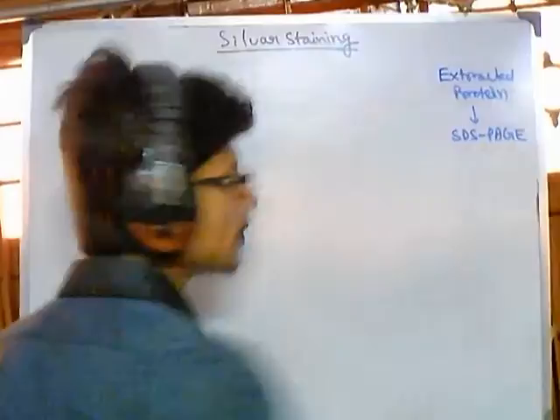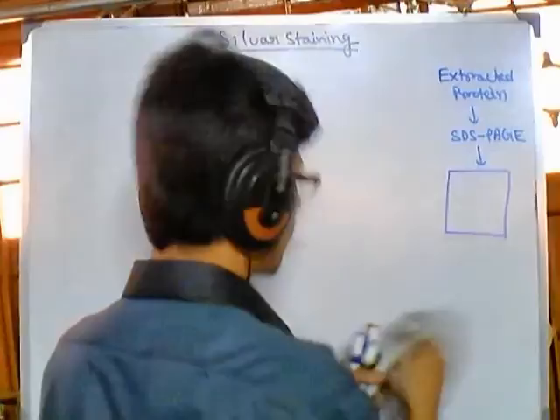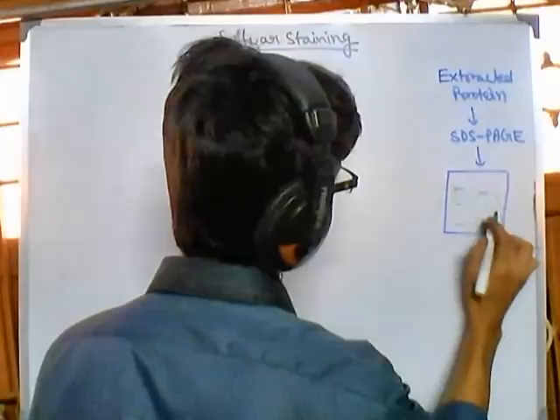Okay, after that what do we get? A band. So if this is the gel, we get a band, let's say a band like that. Let's say this kind of band, we get a band pattern like that.